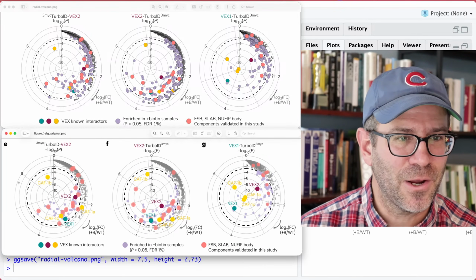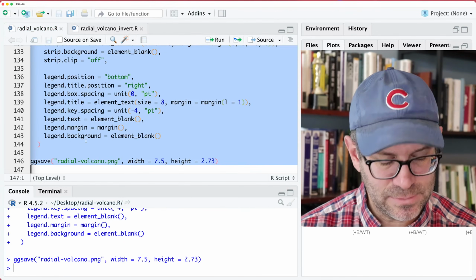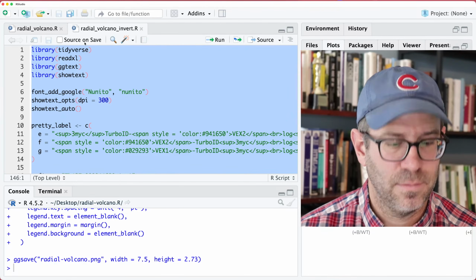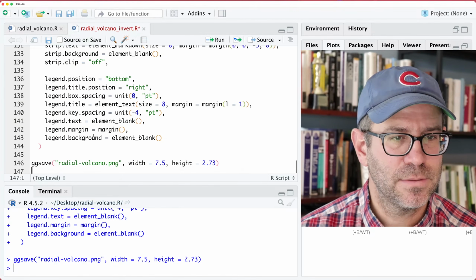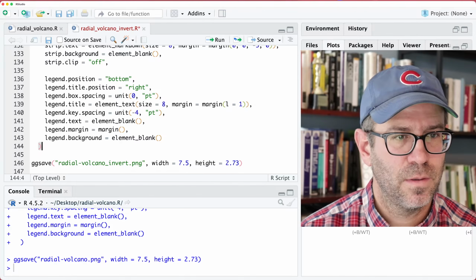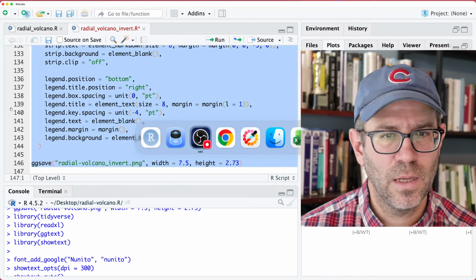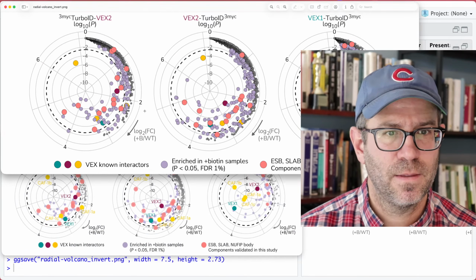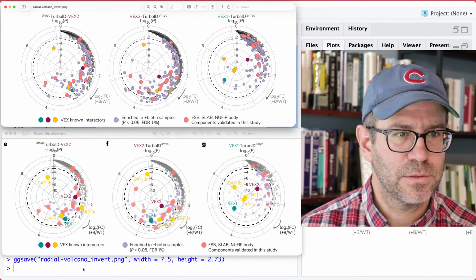All right, so we're good. So again, I'm going to go ahead and save this and copy and paste. Oh, let's try that again. Copy and paste. And so then I'll call this invert. And let's rerun everything. And this should all look the same, right? So it looks the same.